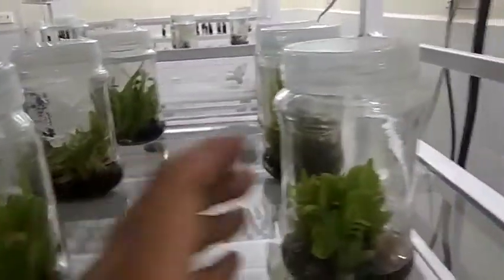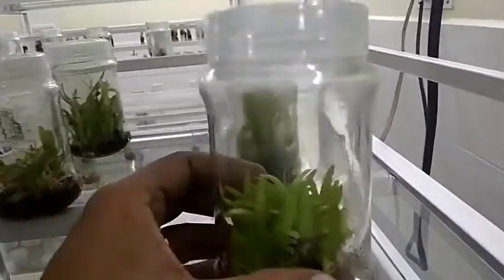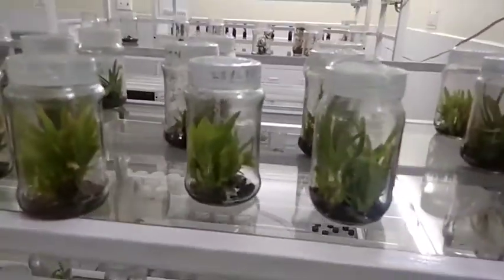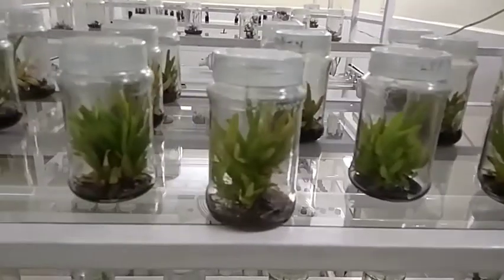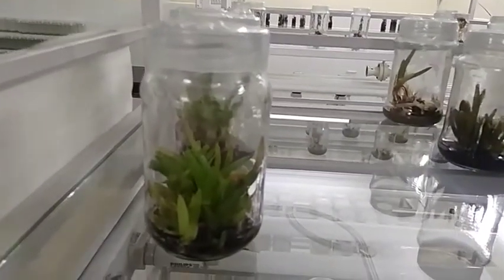You can see the callus and the formation of leaves. Now you can split it and put it into small containers or small bottles, or you can put it into the soil.